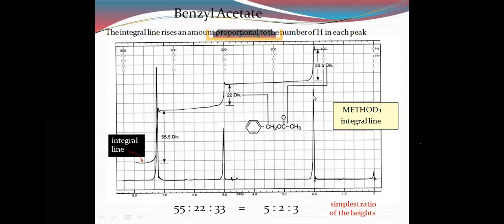And look at position number 2, the chemical shift. This is the methylene group and this is the methyl group. Methylene group is the CH2 group.